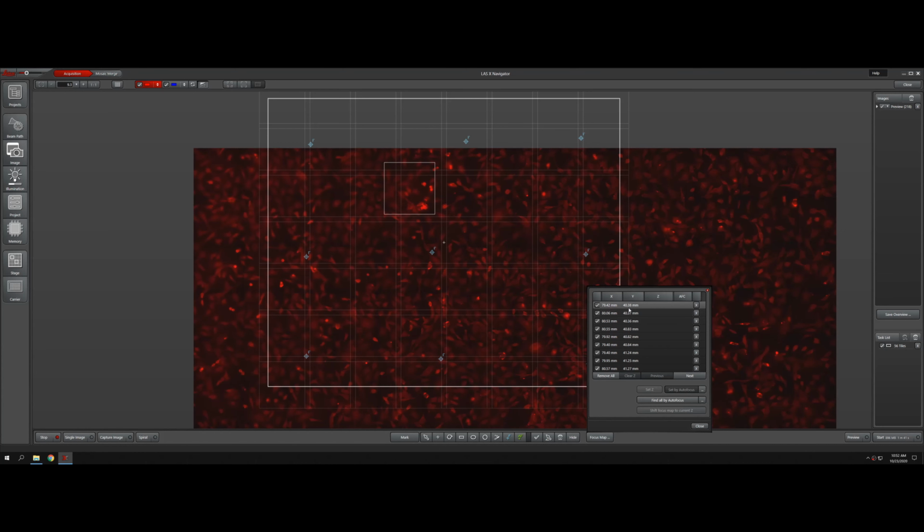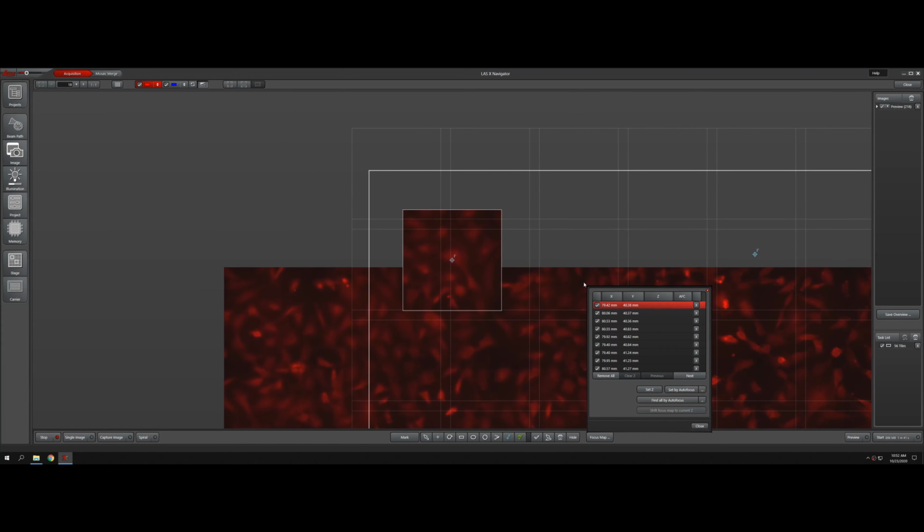And you can visit each of them by just clicking. Once you go to that position, you adjust the Z. There we go.